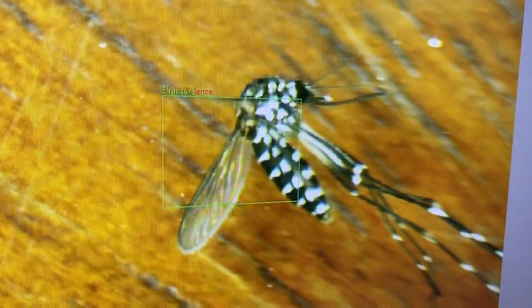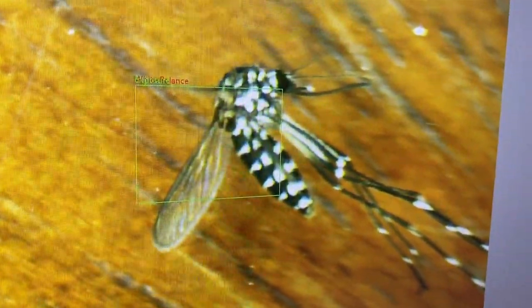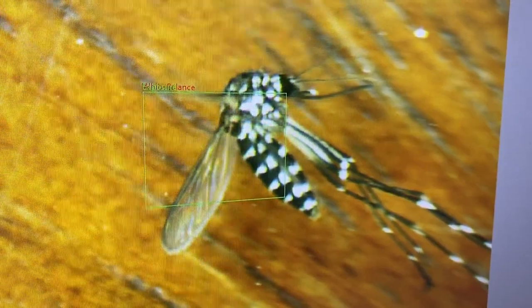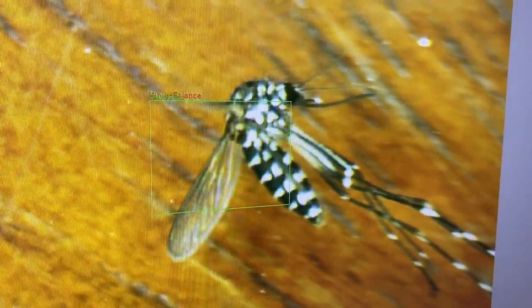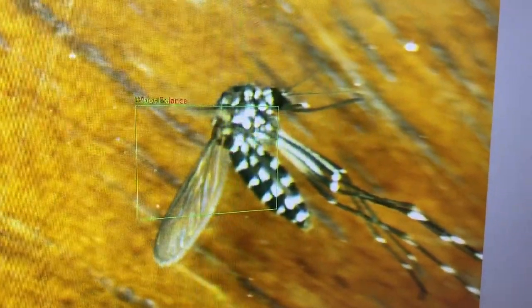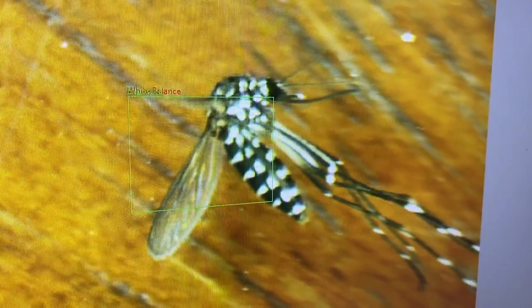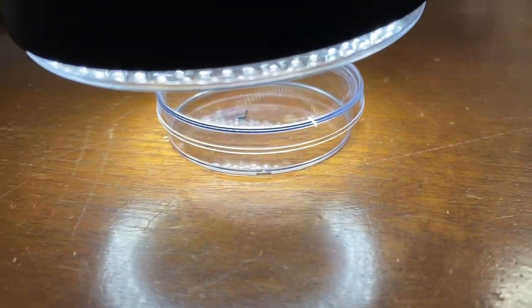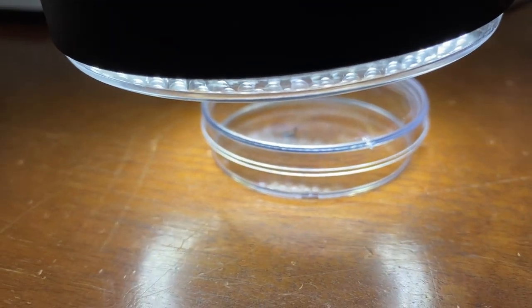Okay, so here's our subject. I don't know if it's dead or not, but I know it's not frozen because I only put it in for a minute, so it wasn't cold enough to freeze immediately. You'll see it right down here, it's in the petri dish. And I'm going to extract the blood in just a little bit.